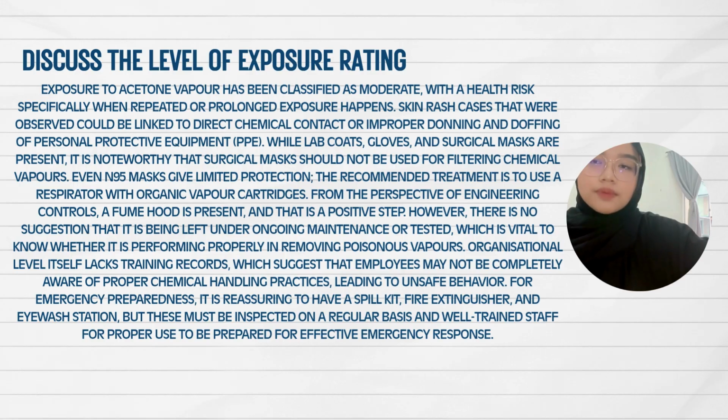For emergency preparedness, it is good to have spill kits, fire extinguishers, and eye wash station, but these must be inspected on a regular basis, with well-trained staff to be prepared for effective emergency response. That's it for me. Thank you.